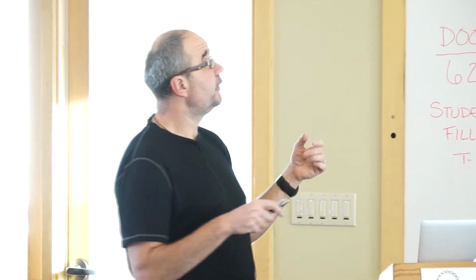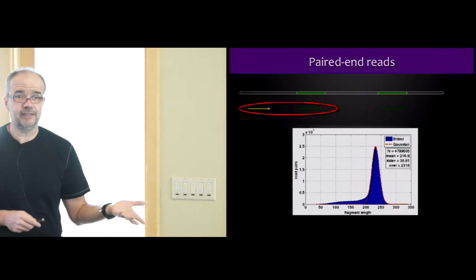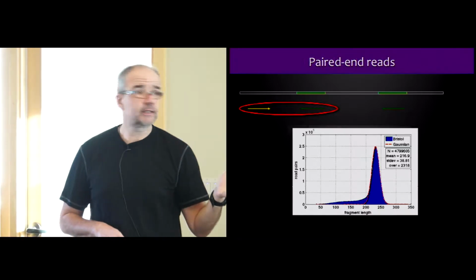So the idea is, if you're sequencing, instead of a single read, a longer fragment, then the chances are that at least one of the two ends will map into a unique sequence and can be confidently placed. And then you can choose between multiple possible locations for the other mate that maps into a non-unique sequence. So it makes sense? This is how you're able to place read pairs better than you can place individual reads, and that's why you're seeing most of the sequencing today done as read pairs, especially in the Illumina technology.